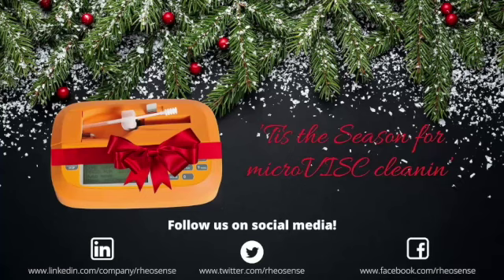So before I hand this off to Damien and he can tell you about our chip cleaning station, I just wanted to talk about some advanced protocols for microVISC chip cleaning, or MV-rod cleaning as well, for that matter. So you could add a pause time before your measurement starts that will allow for your sample to relax.